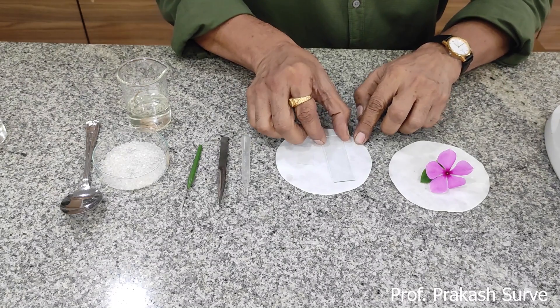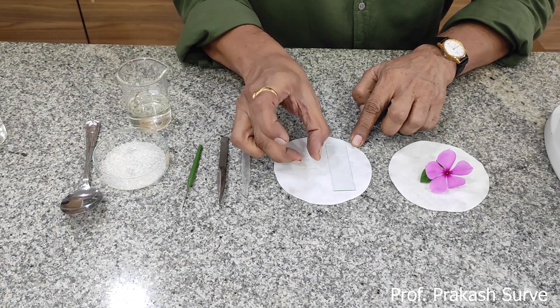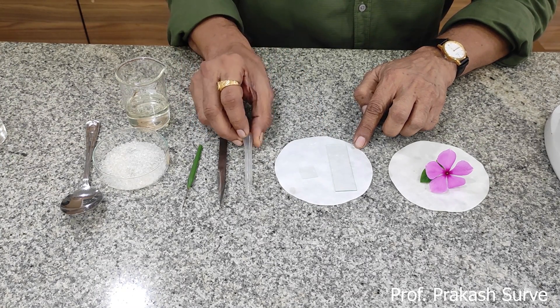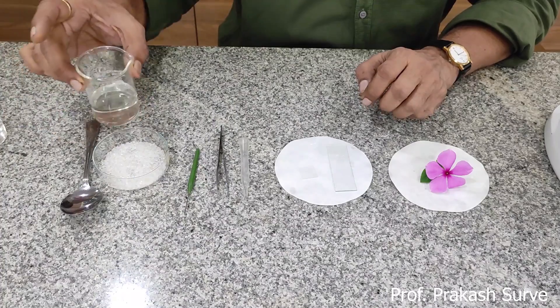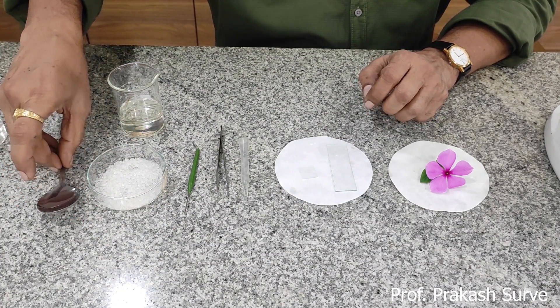We also require one clean slide as well as one clean cover slip, a dropper, one pointed forcep, one needle, and we have to prepare the sugar solution. We need the normal sugar that we get in the market.